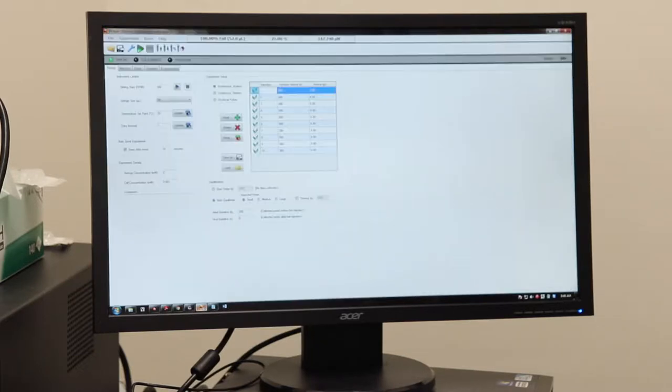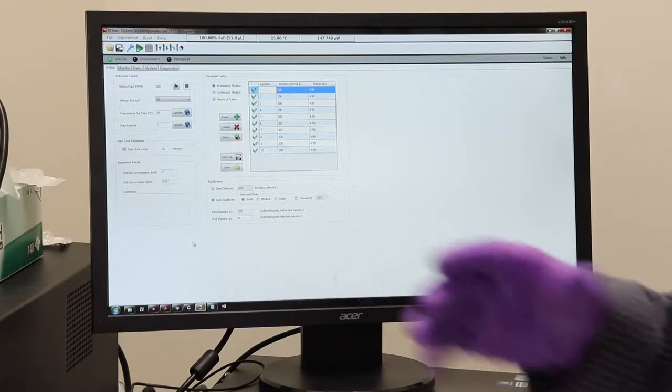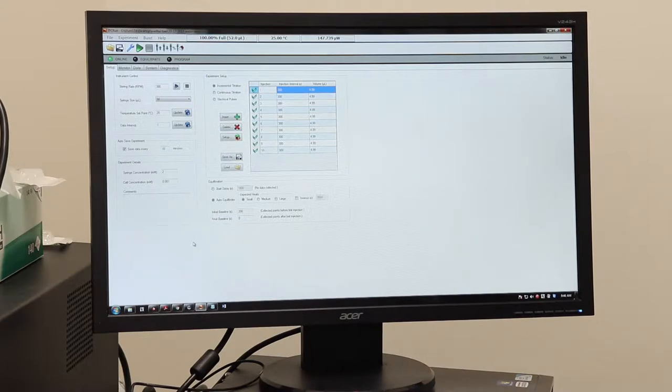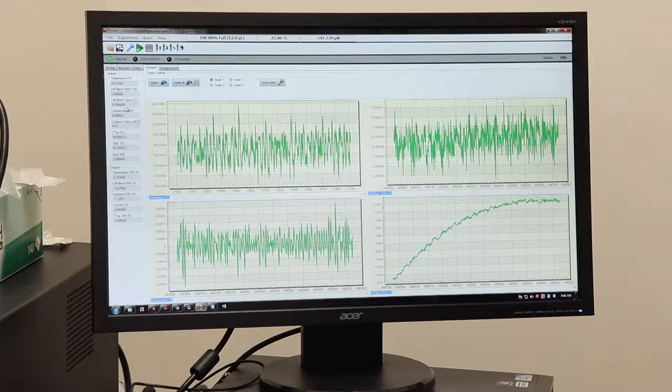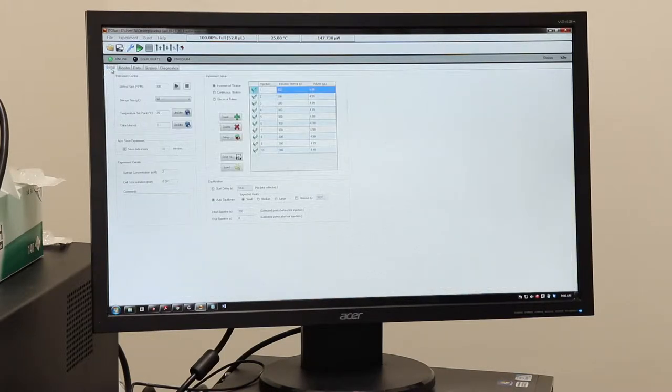Other software is ITCRUN. Okay, so to start with, the computers log into Windows all the time. You shouldn't have to log in with your NetID. In fact, don't. Don't log out of Windows when you're done. Also, the ITCRUN program should be up and running all the time. That will keep the sample cell at 25 degrees. Otherwise, it takes about an hour or so to really stabilize the temperature. There's numerous significant figures on the cell block temperature, so it stabilizes very specifically. You can use it at different temperatures. You just have to wait until it equilibrates and then set it back to 25. Also, the degasser is set at 25 so your sample is going in at about the right temperature. So that's the ITCRUN. That's where you'll set up your experiment and run it and monitor it as it goes.